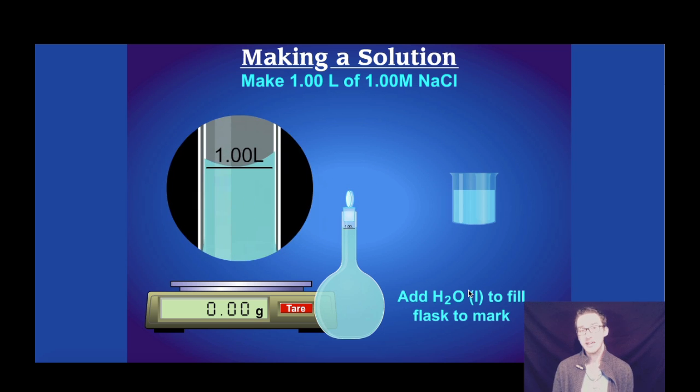And so as we look here, we filled exactly one liter of solution. We have exactly one mole of our solute. So we have just created one liter of a one molar sodium chloride solution. I'm so proud.